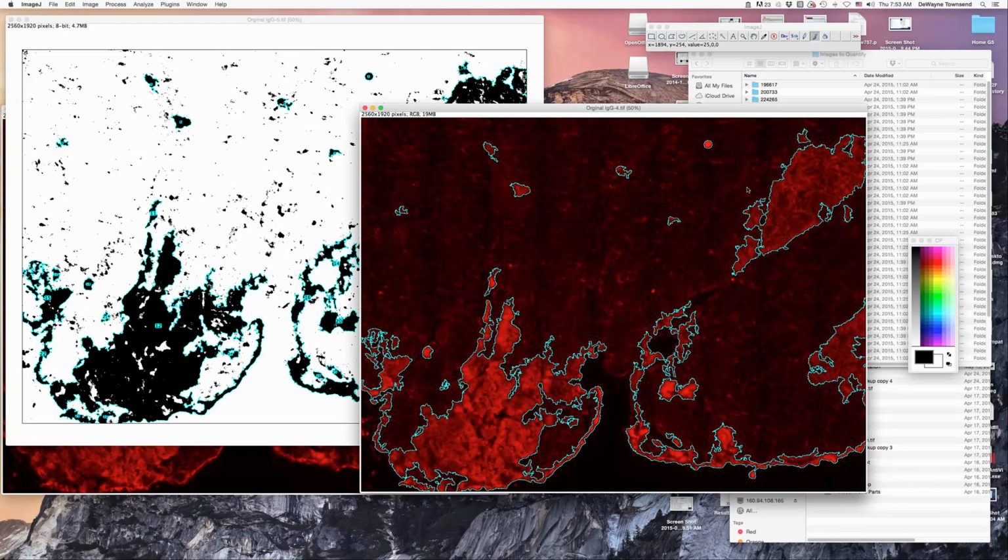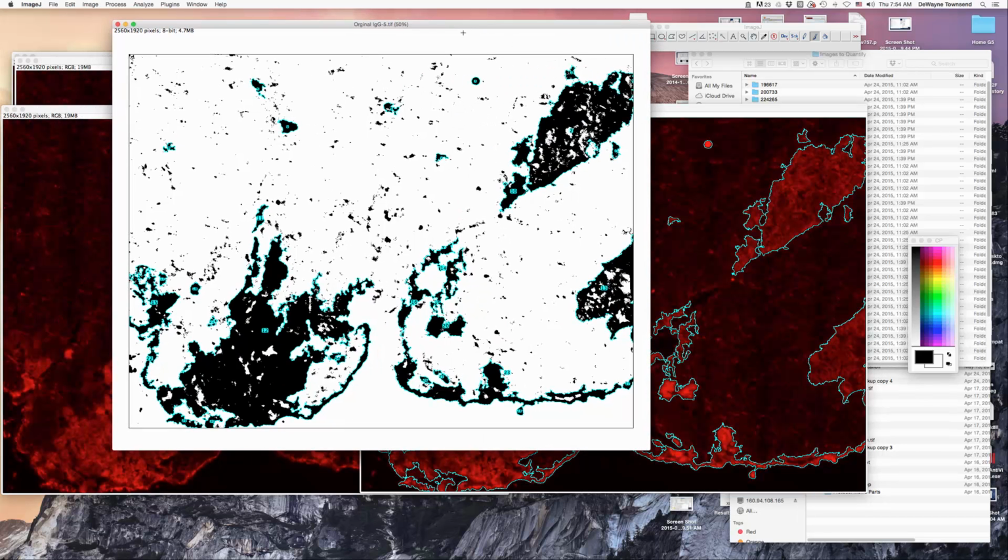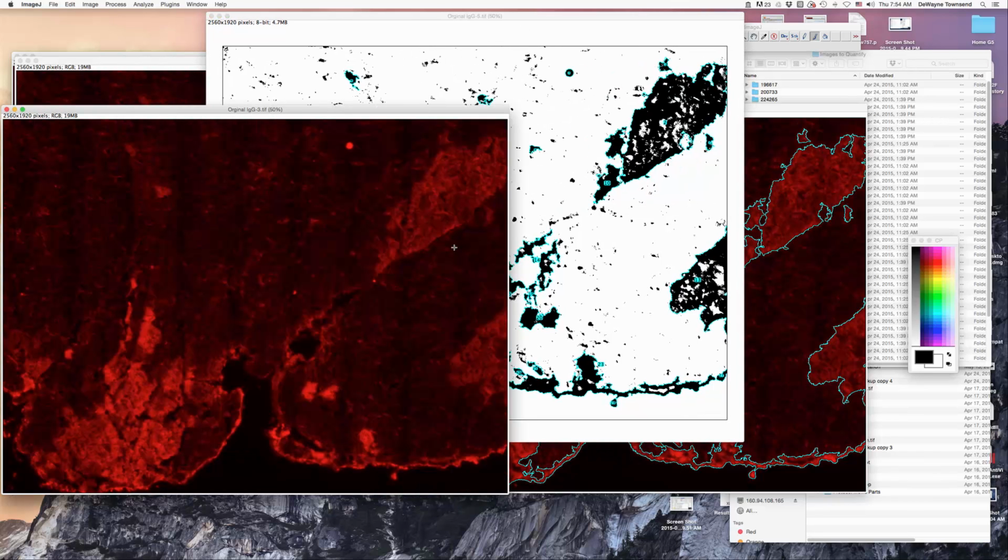And if we want to see that here, what we need to do is go to Image, Overlay, and from ROI Manager, which then updates that. And so now you can appreciate how it's included all of this. Okay, so that's good. And then we've got to do, looks like something up here similar.